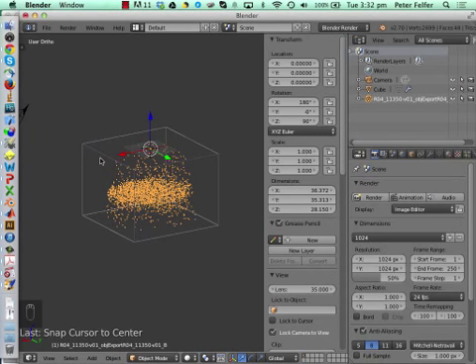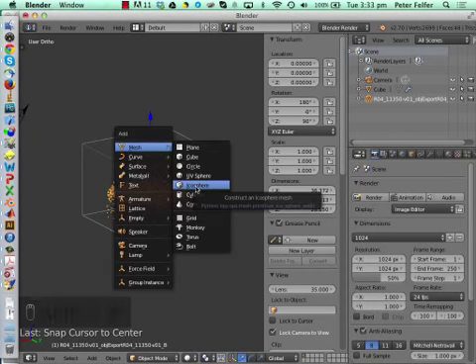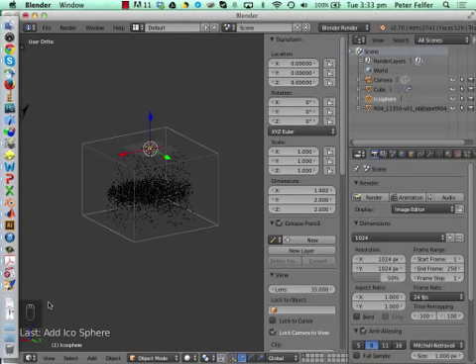I render carbon in an image, and then I render nitrogen in an image or whatever. But maybe you want to have two side by side, then you need to do that. But try to stick with 0 as the origin. And we go and add mesh icosphere. Of course, you could use a different object as well, but icosphere is the most common one.